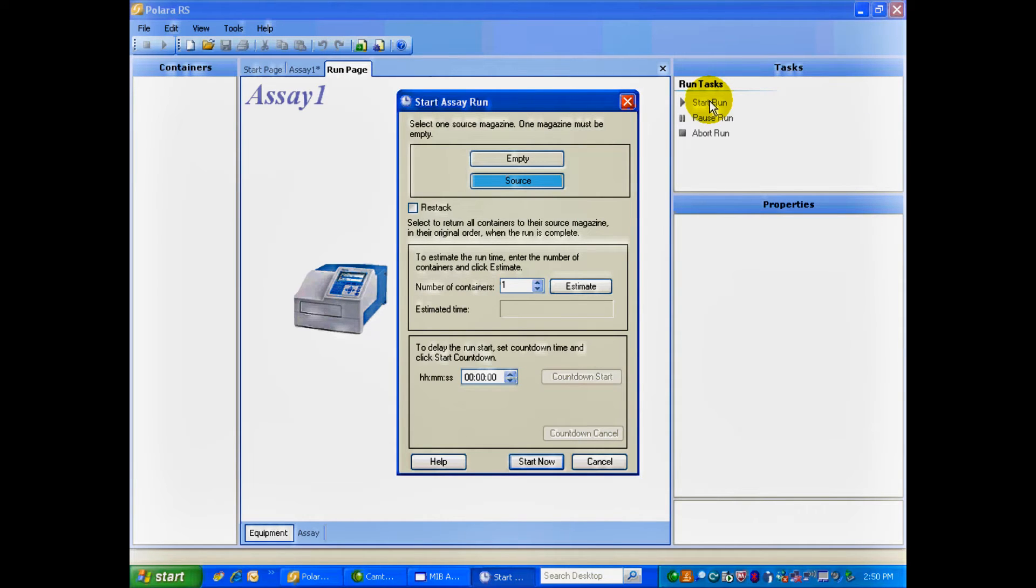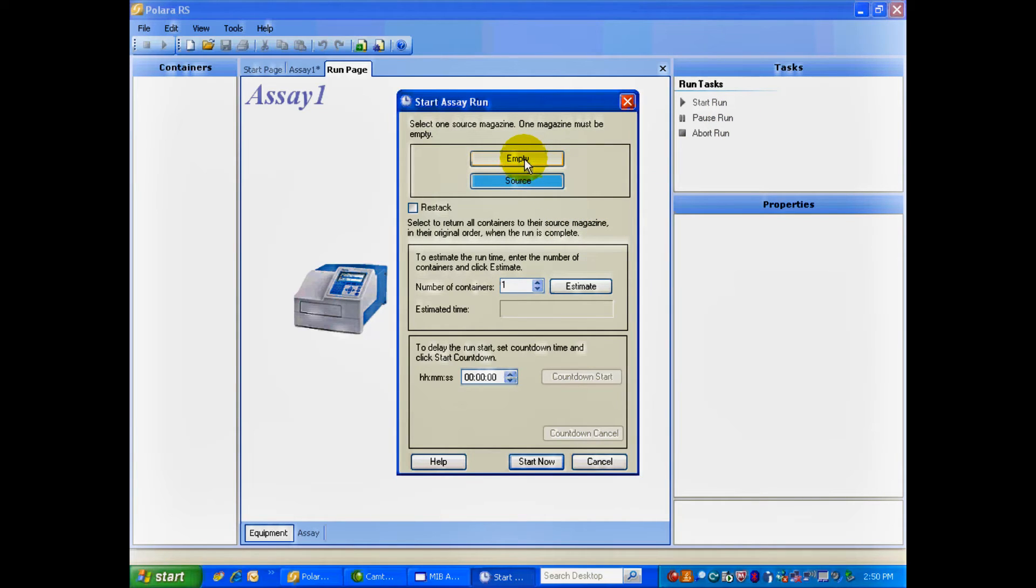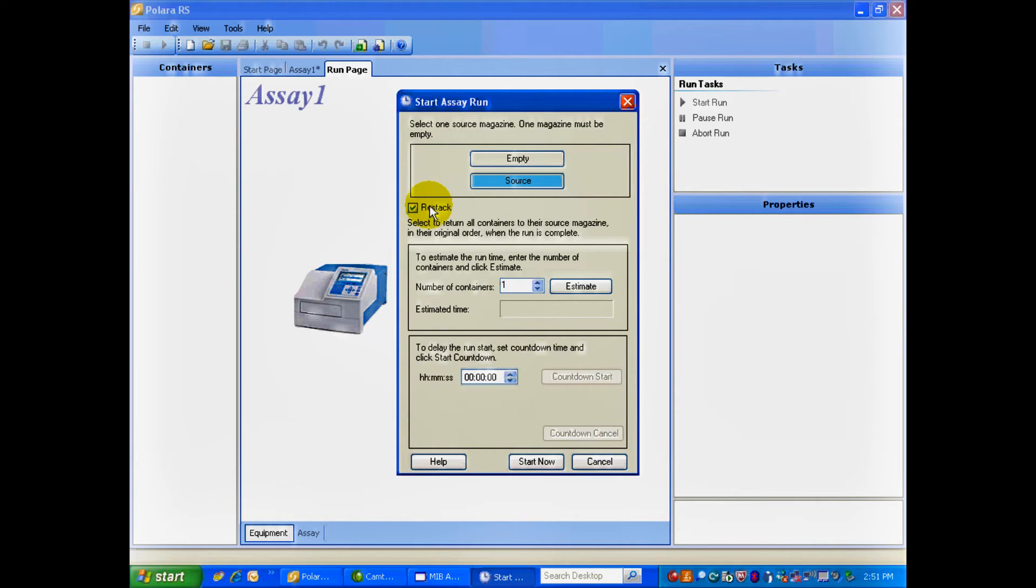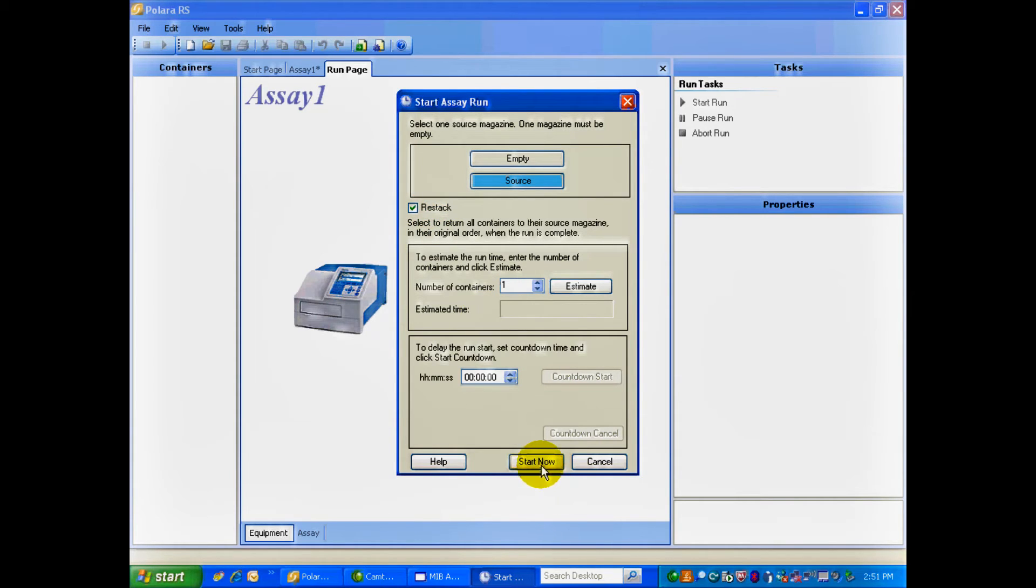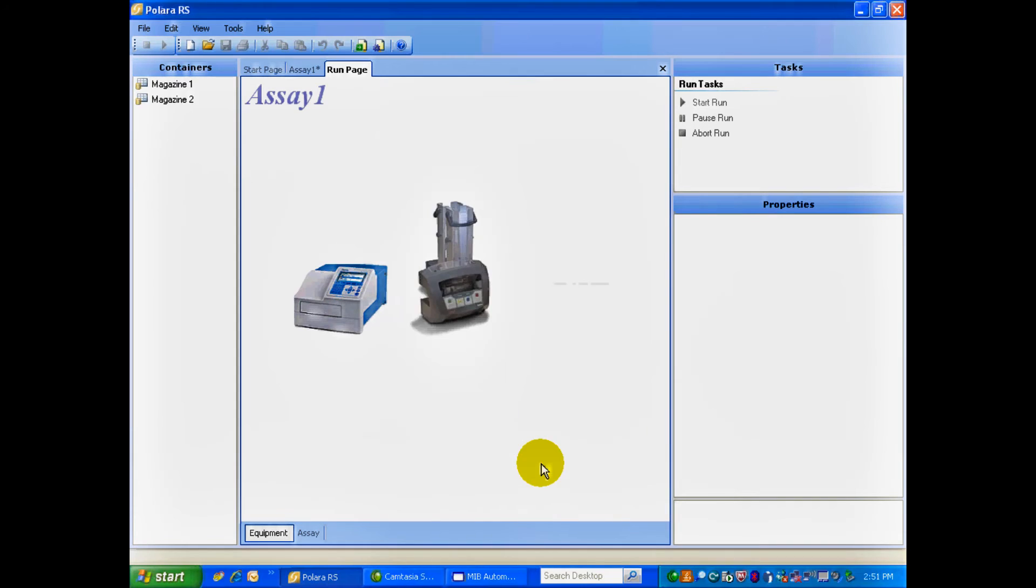You'll see here, the Start Assay Run screen come up. Your Source Plates are in the front. Your Empty Stack is in the back. I'm also going to select the Restack button, so that the plates move from the Empty Stack to the Source Stack at the end of a run. All I have to do now, is select Start Run.